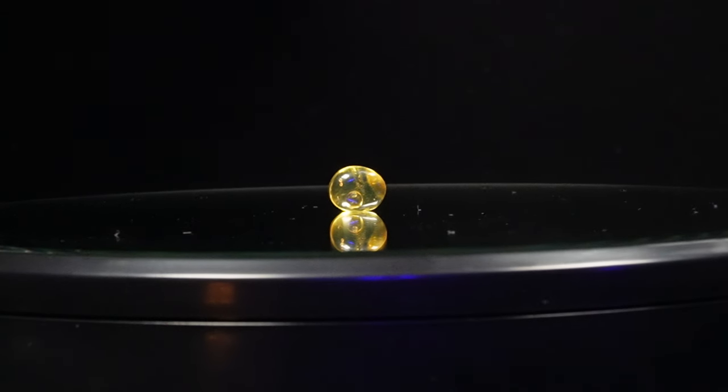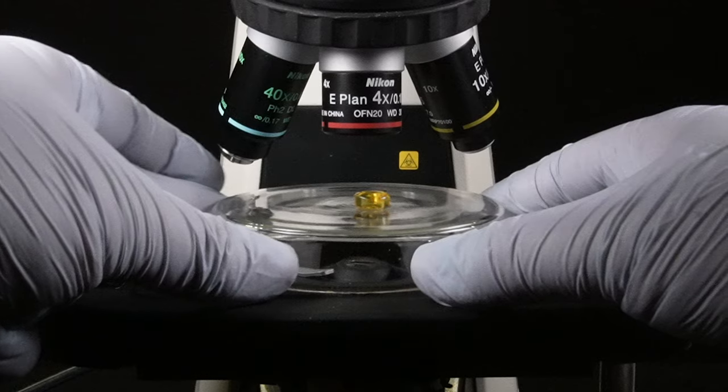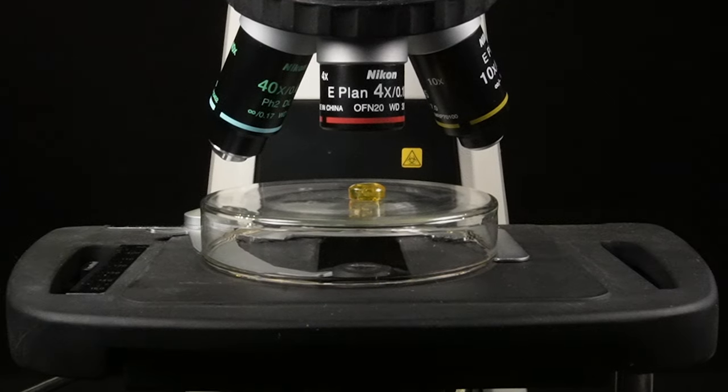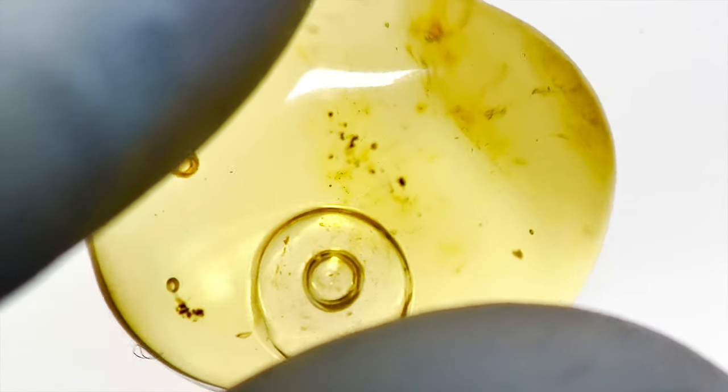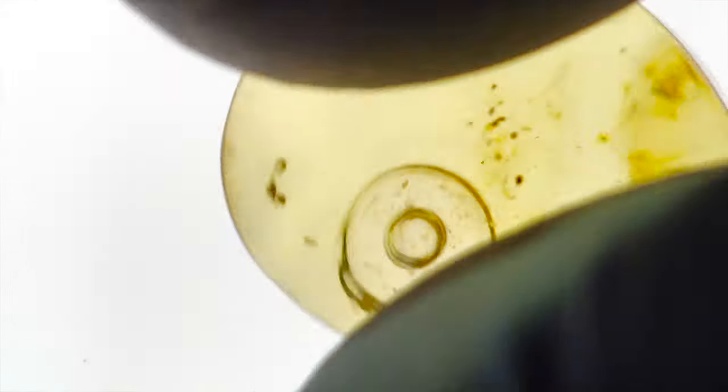The first sample we're looking at is 20 million years old. Let's have a look at the samples before we even crack them open. Here's what the 20 million year old amber encapsulated water drop looks like under the microscope.